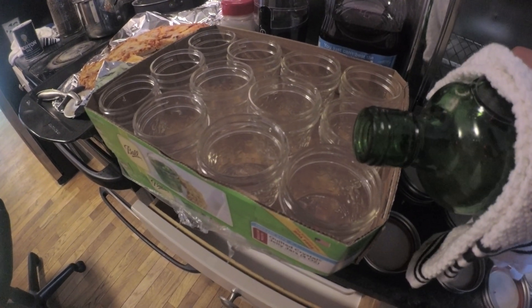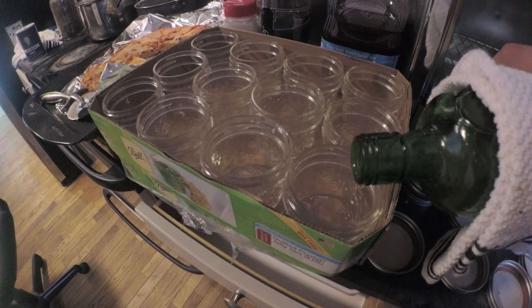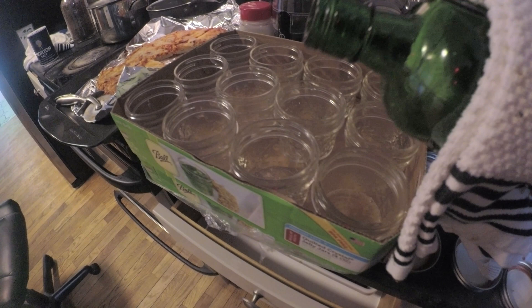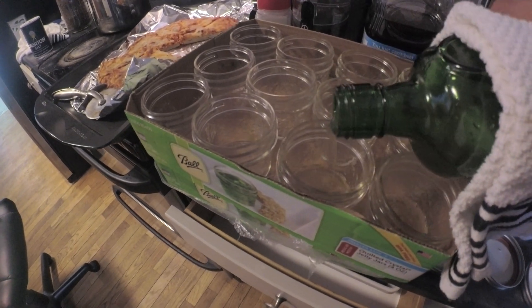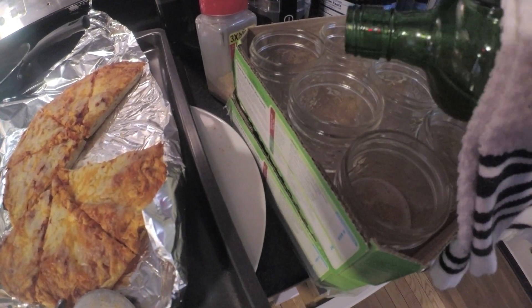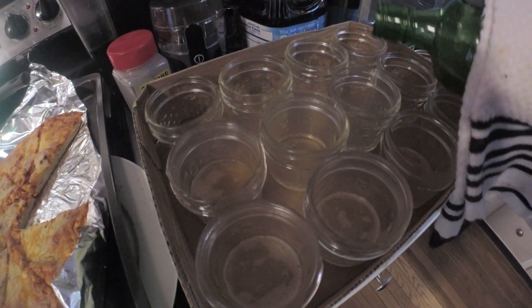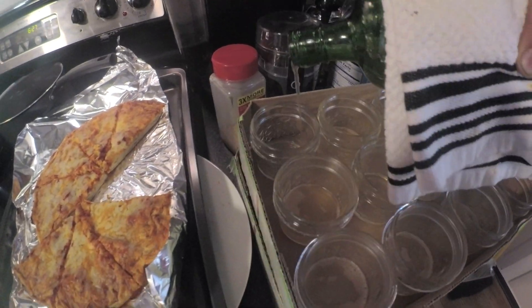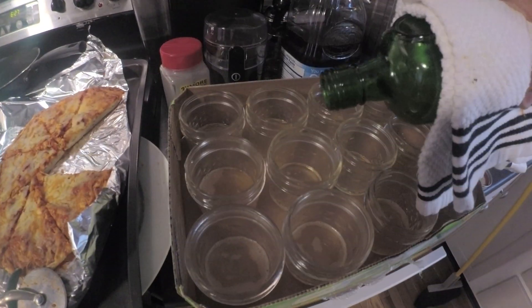Here you see me pouring in a non-sterile environment right next to that pizza. You want to make it have a nice little layer on the bottom. You don't want it too thick because then you're just wasting agar, but you don't want it too thin because it will dry out.